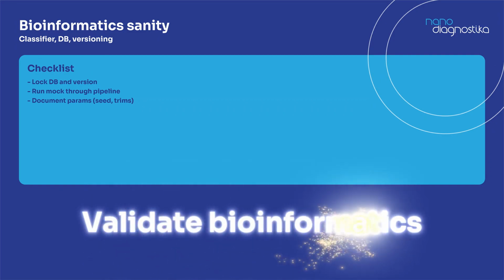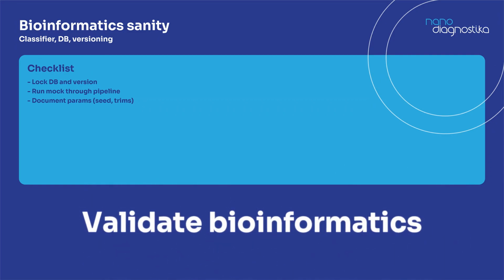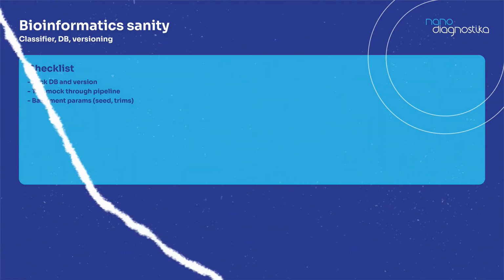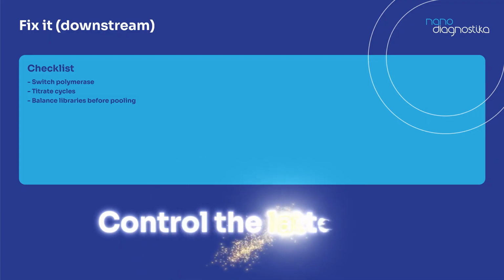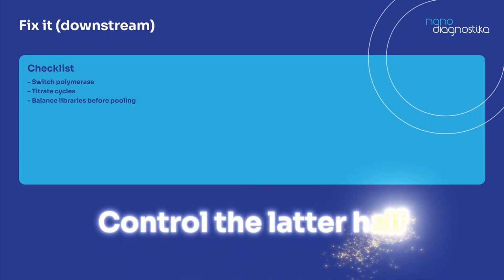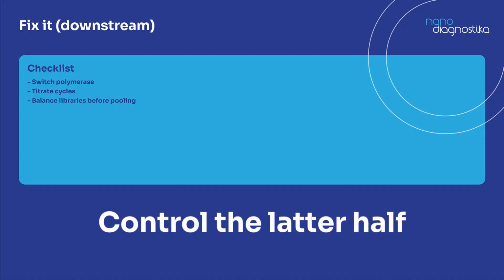If you sequence a DNA standard and the results don't match the expected community profile, you know the error lies in those downstream stages, since all the DNA was there in the correct proportions from the start. In short, the DNA standard serves as a control for the latter half of the workflow, ensuring that once DNA is free and available, your process amplifies and sequences it without distortion.